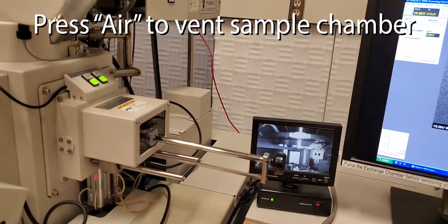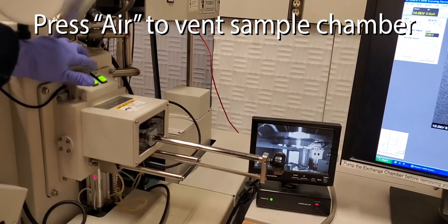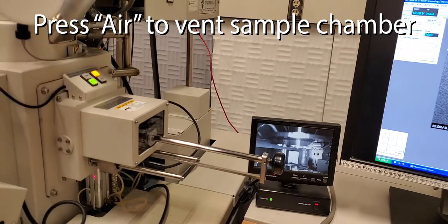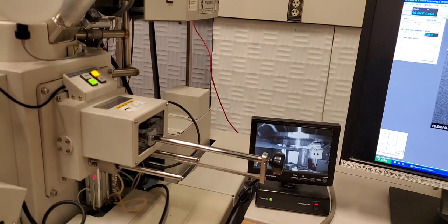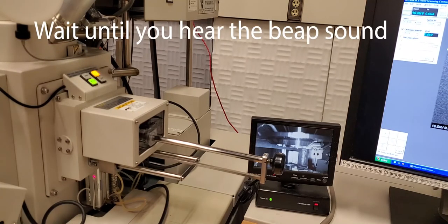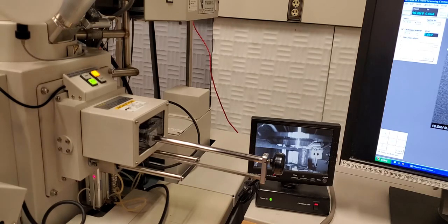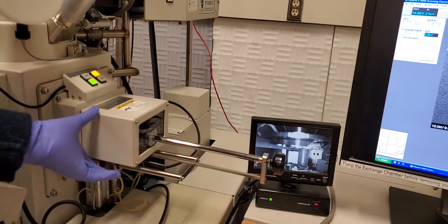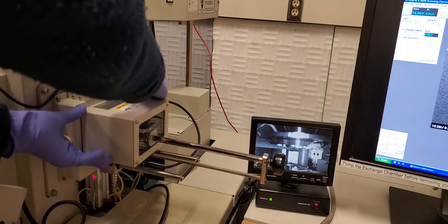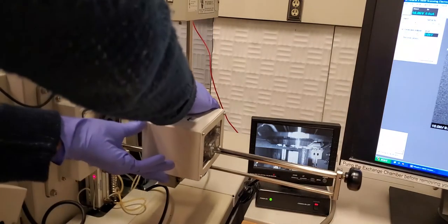So now we're ready to load the sample. First, we're going to press the air button on the top here, and we're going to vent the sample chamber. You're going to wait for the beep, and then you can know you can open the box. Do not pull on the rod. Instead, put your hands on the box and gently slide it open.